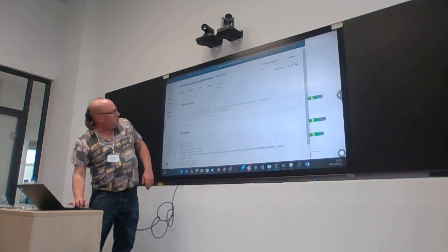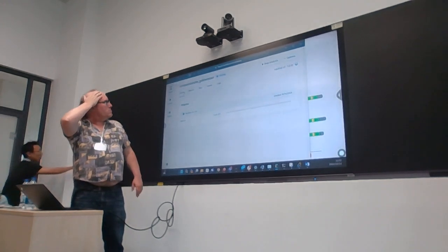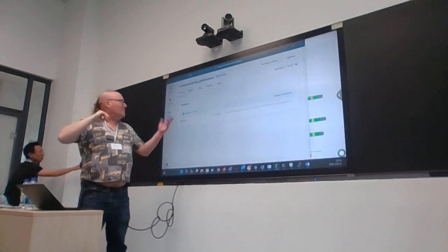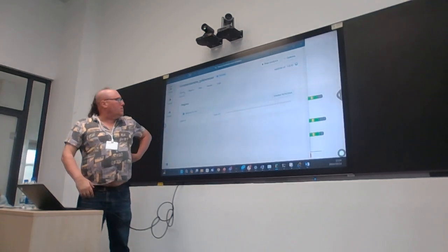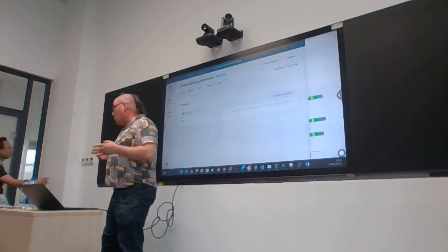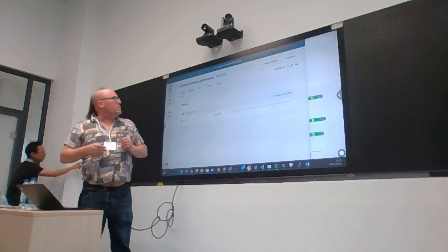It's still busy starting. Submitted process details. Come on, Squirrel. It doesn't take that long, but my computer really is not strong for this stuff. And it gives you a very nice quality control report once it actually runs.